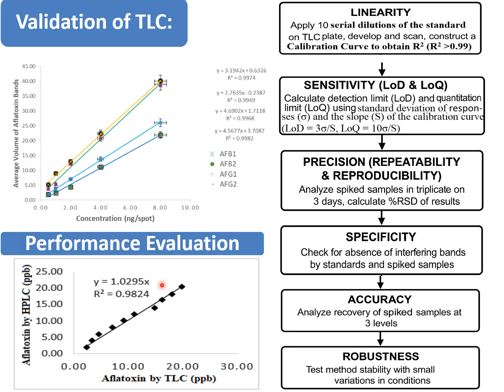Now, a method that demonstrates good performance evaluation should have an R-square value above 0.95. That is, it must be at least 95% accurate when compared with a gold standard method. Such method can then be adopted for analysis of a known analyte in a sample.